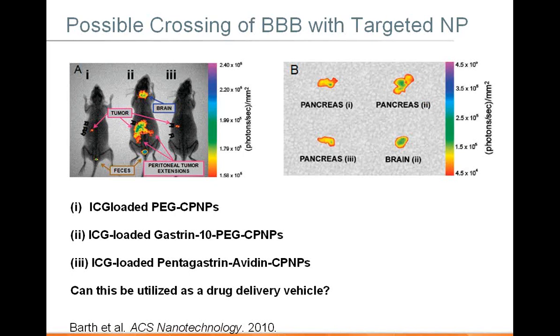They also wanted to look at whether they could induce these calcium phosphate nanoparticles to cross the blood-brain barrier. Using ICG-loaded nanoparticles with a PEG-coated negative control and other potential targeting agents, they found that the gastrin peptide caused uptake into the brain quite nicely. A follow-up experiment would need to confirm by microscopy that the nanoparticles got past the blood-brain barrier and into the brain — but you can see a significant increase in fluorescence at the brain with the gastrin-coated ICG-loaded calcium phosphate nanoparticles.